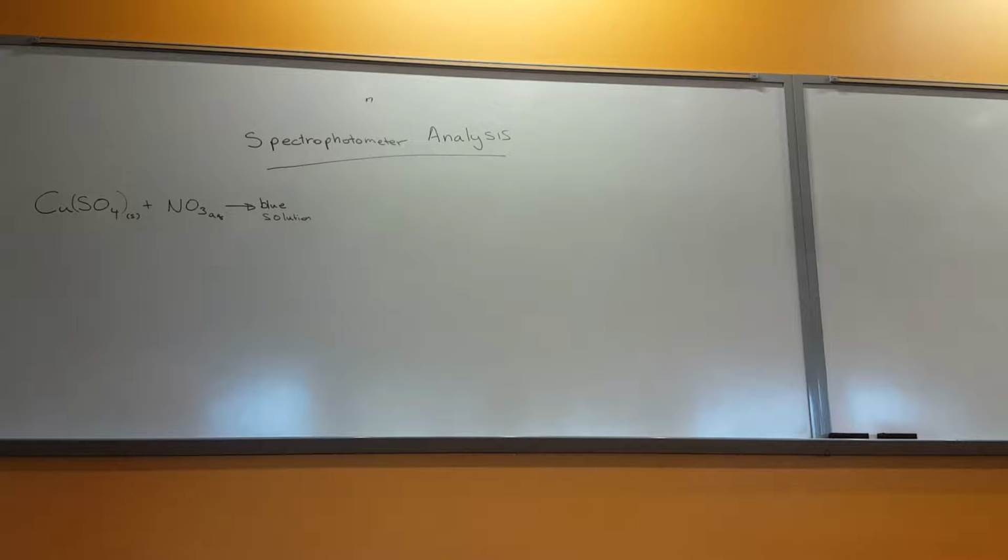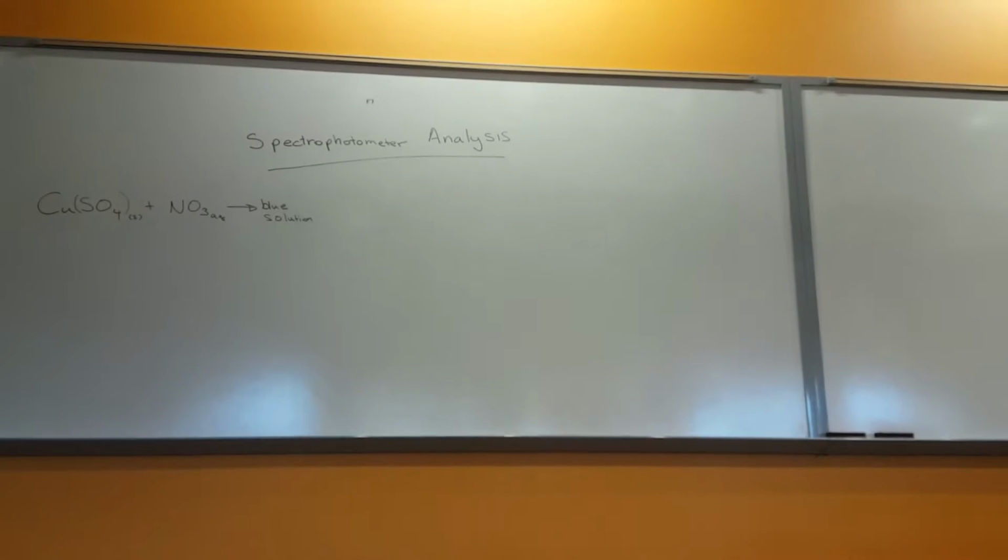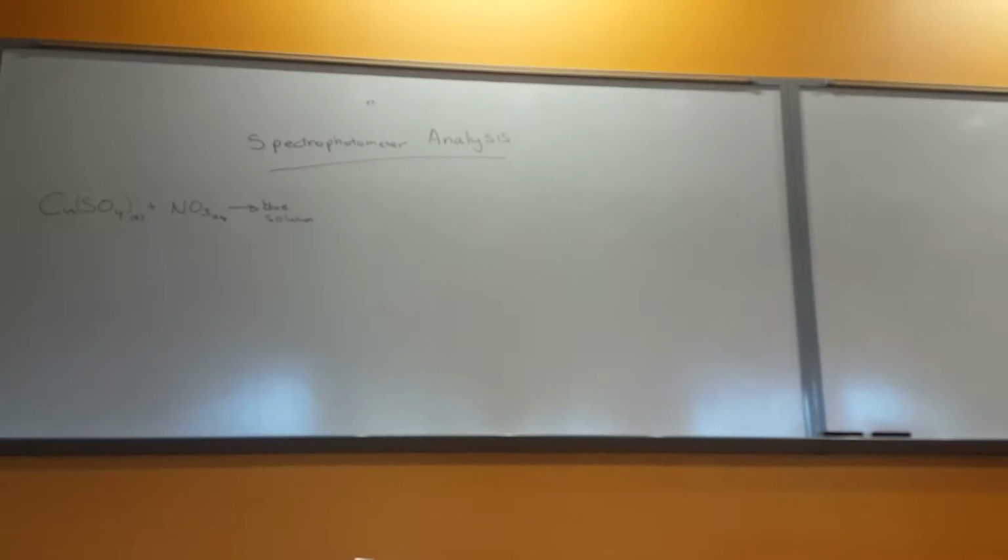And so one way to look at that is what a spectrometer does: it shines light into the system. So you can create what they call a standard. When I say standard, in other words, we go over concentration, and we go over that.